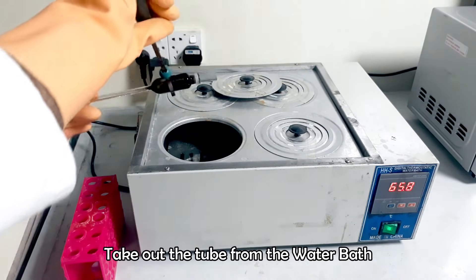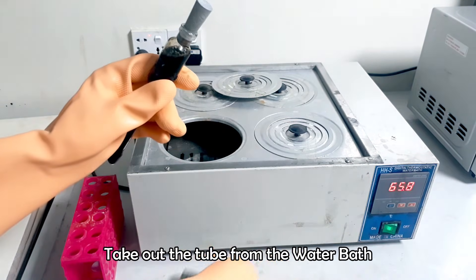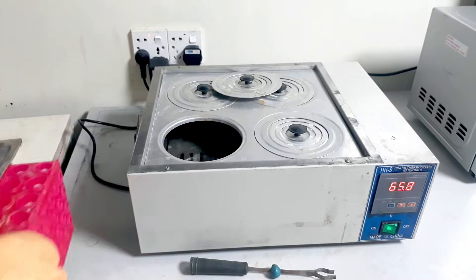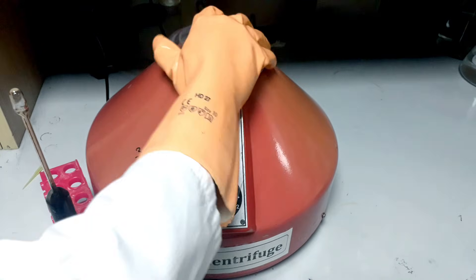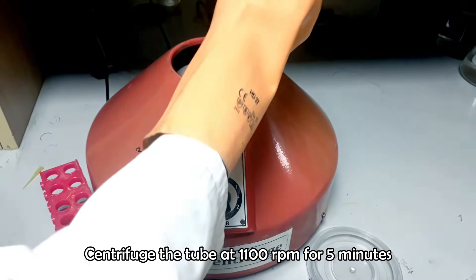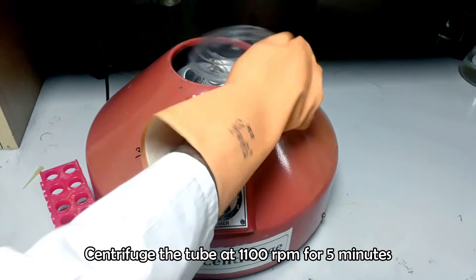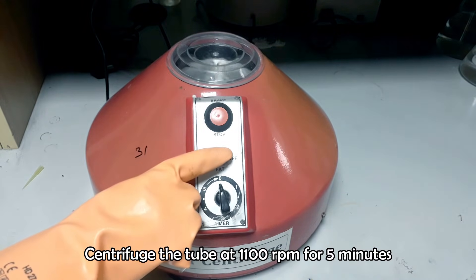After 5 minutes, take out the tube from the water bath and bring it for the centrifugation. Take care. Centrifuge the tube at 1100 rpm for 5 minutes.